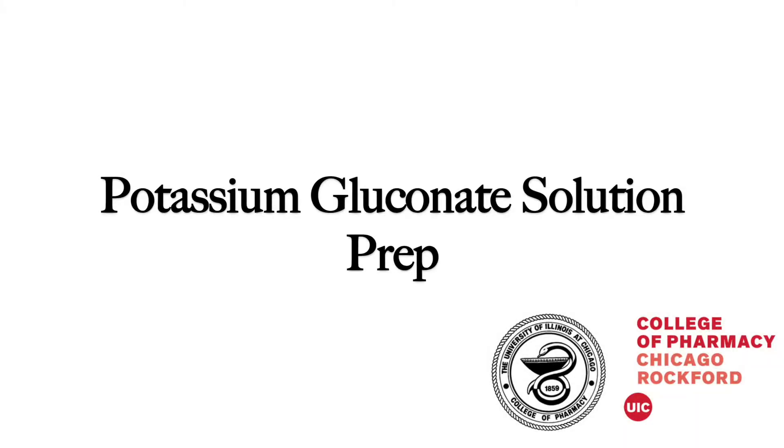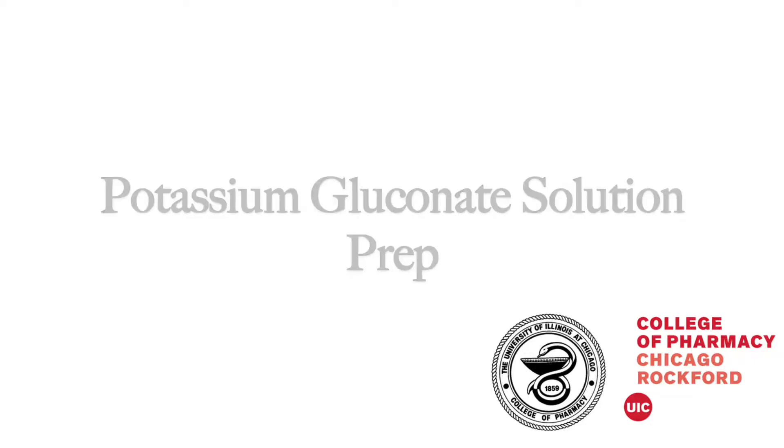For this video in the Pharmaceuticals video series, we will be showing you how to make a potassium gluconate solution.